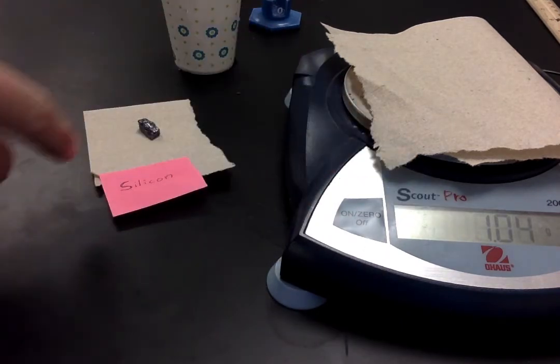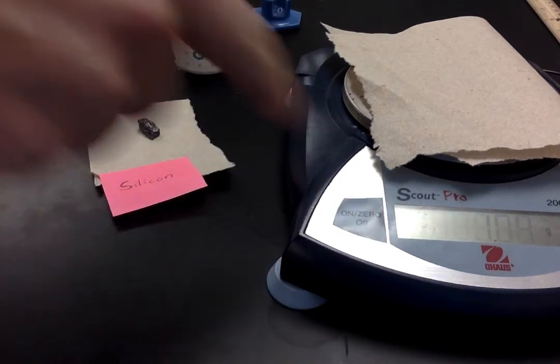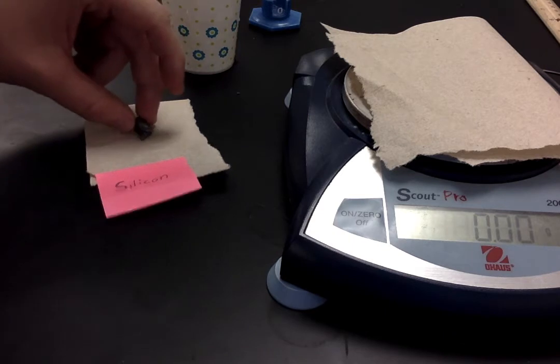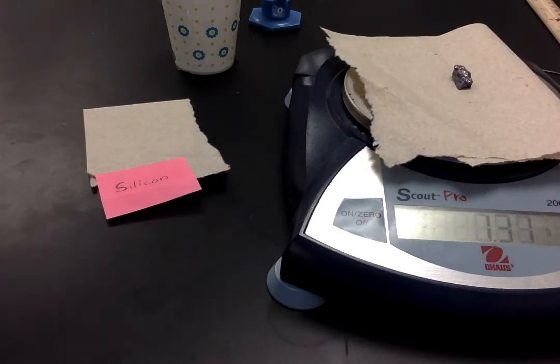And so you can see right now the scale reads 1.04, so I'm just going to zero it. That way the scale won't count the mass of the paper towel when I put the silicon on there. Silicon has a mass of 1.34 grams, so go ahead and write that down on your lab sheet.